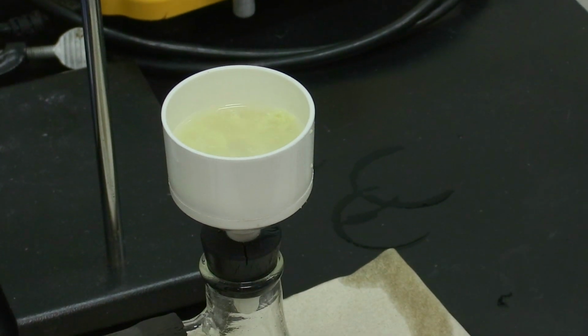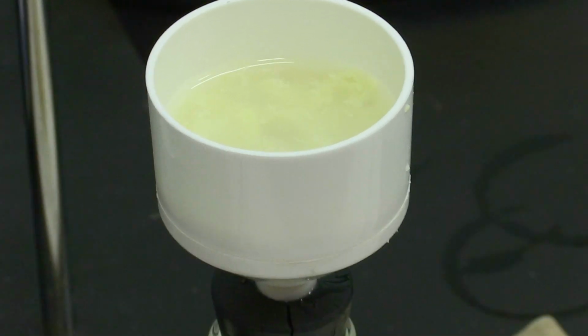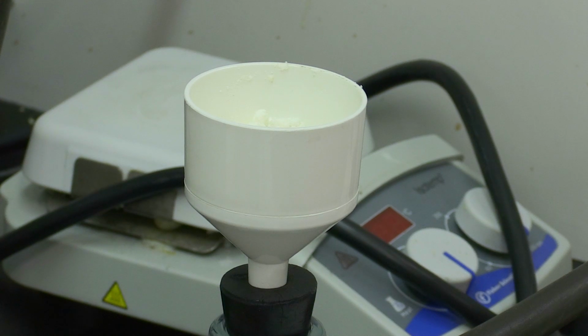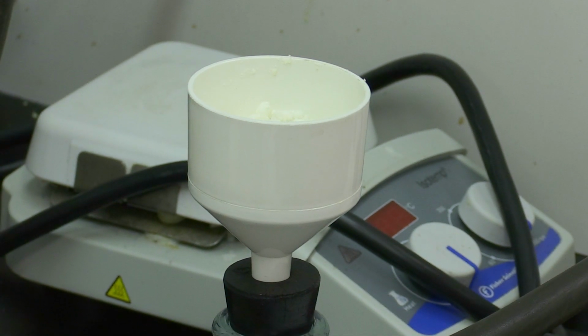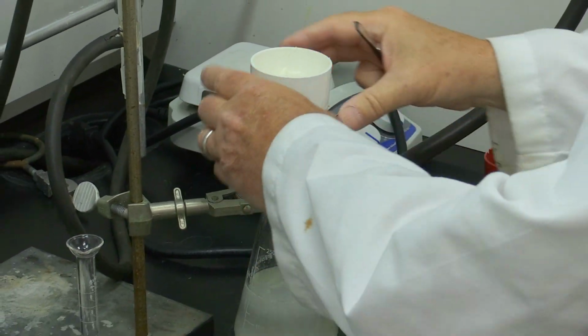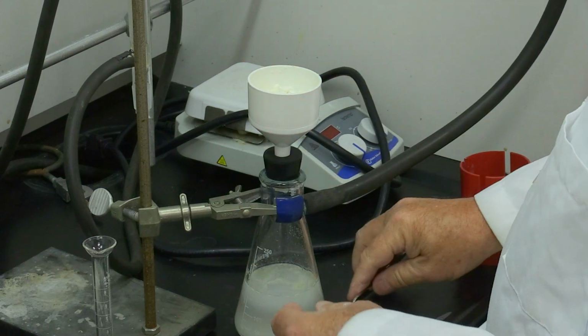Our two boiling chips stayed behind. So we've let this dry under suction filtration for several minutes. Turn off the vacuum. And now we want to remove the product.